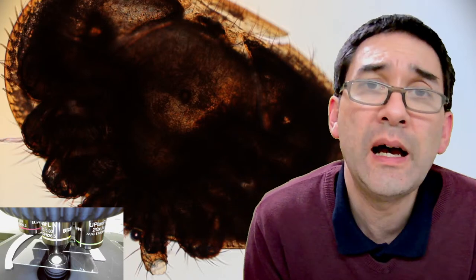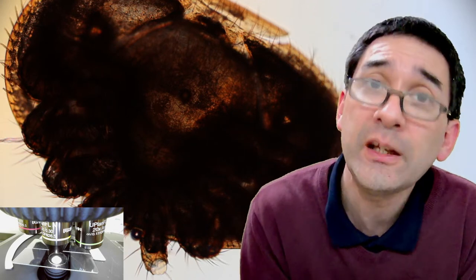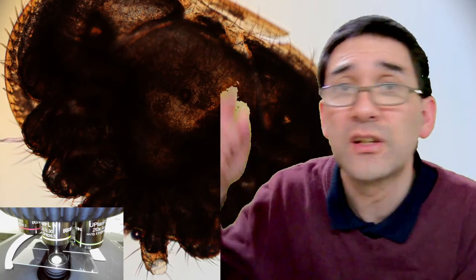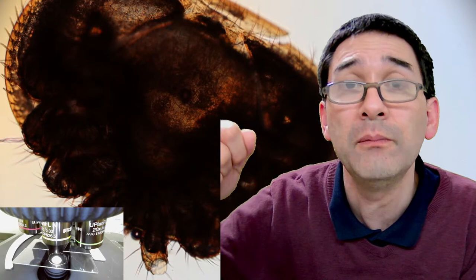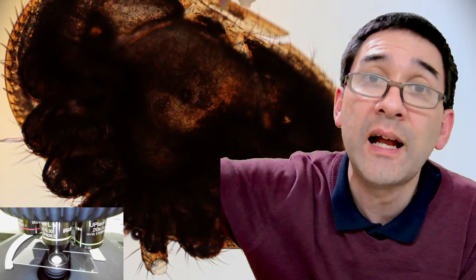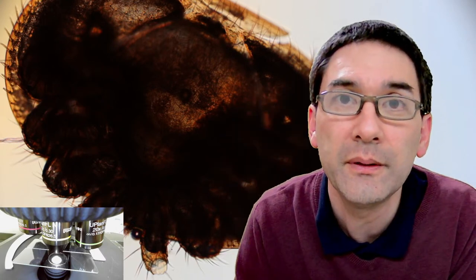What you have to do is make sure that the mounting media, especially if you make one yourself, do not contain too much dissolved air. And what you do is you apply a vacuum. There are vacuum systems that are not electrical pumps: you can create a vacuum by connecting a flask to a specific system with flowing water. So basically you connect it to your tap, and you turn on the tap water, and because the water streams down, it pulls the air out of the flask. So it's able to create a pretty strong vacuum. And in the lab, we've used these systems to degas certain chemicals.